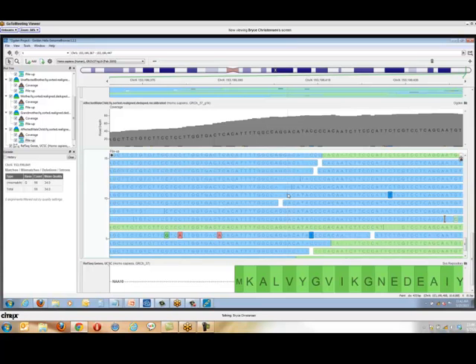So what I used on the quality was a GATK quality score. I set it at a threshold of 20, which, as I mentioned, is equivalent to about 99% confidence. For the read depth, I just picked an arbitrary depth of 10 because I've looked at this data before and I know that there's a lot of noise below 10 if you compare the read depths to the quality scores, especially outside of the X chromosome, where it was incidental coverage. A lot of those were down below 10, and you can see that below 10 the calls just weren't very good. So it was arbitrary.